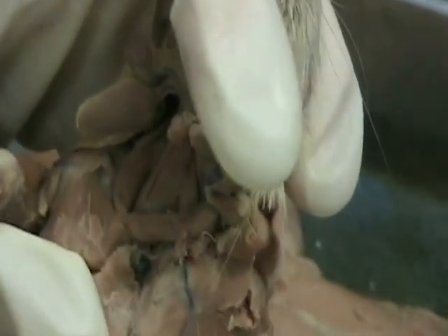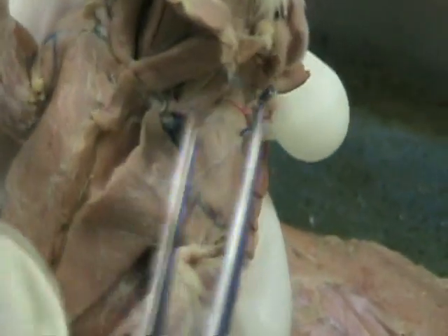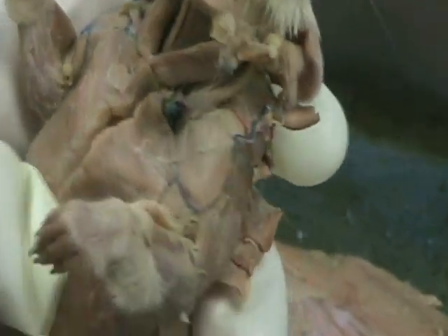Oh, that's right. Okay? And the omohyoid goes to the shoulder? Right. So when we cut and reflect the shoulder back, it's affected. You can keep it intact, but you can definitely see it pulled on. Alright, so now for this area right here, we have this muscle going from the clavicle to the arm, cleidobrachialis. We have the pectoralis here. Only know it as pectoralis. Don't worry about profundus or superficialis or anything like that.